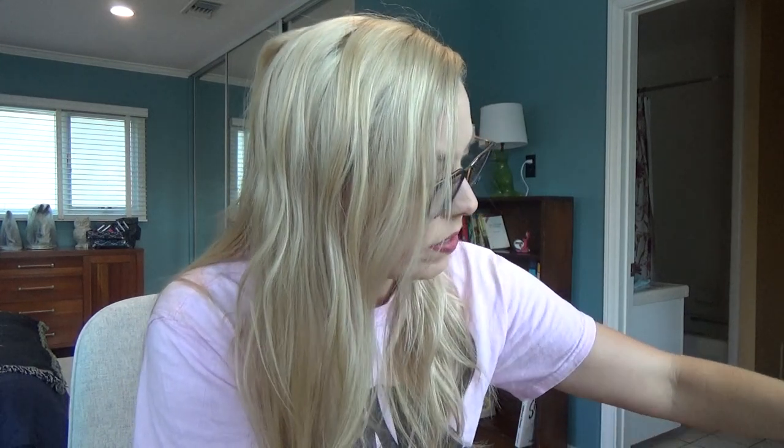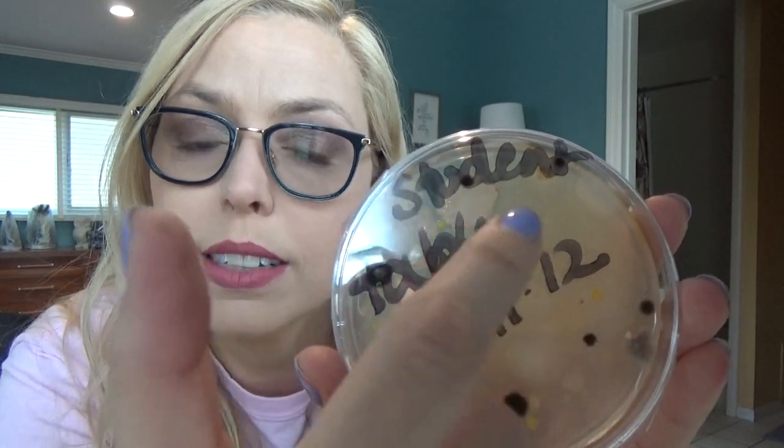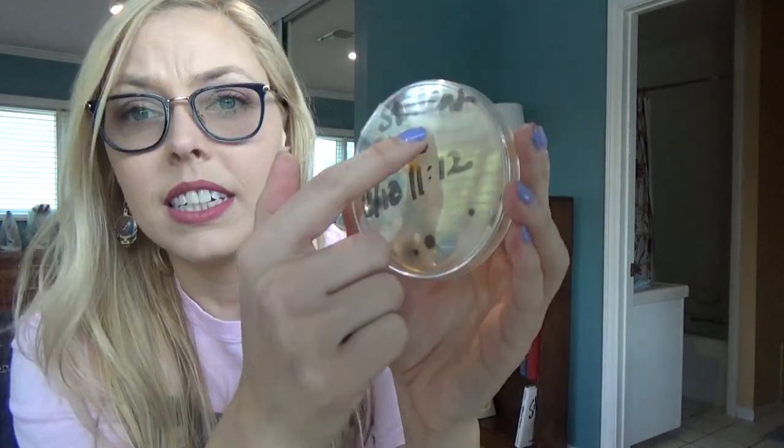Let's look at the chairs and tables, and then we'll look at keyboards. Looking at this student table — one of my kids from third period, maybe Anakin, went around and swabbed all of the tables. There are a lot of different colonies growing: an orange one, a bunch of little black spots, a lot of yellow, and what looks like colonies within colonies. There's also what looks like a big water spot on top, but it's actually one ginormous colony of bacteria growing. I was cleaning those tables like crazy the week we left school, but still bacteria on them.